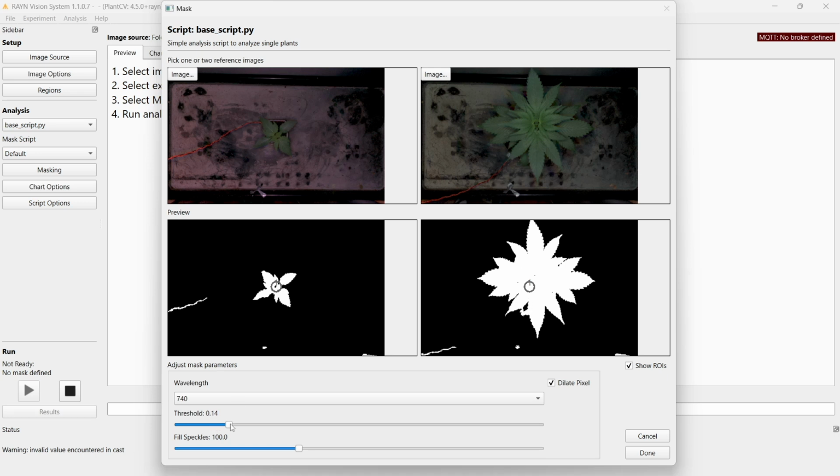So that's why I would still decrease and further decrease the threshold. Right, so this is a little bit too much. You can also simply press or left click to the right or the left, and it will automatically go the next biggest step.